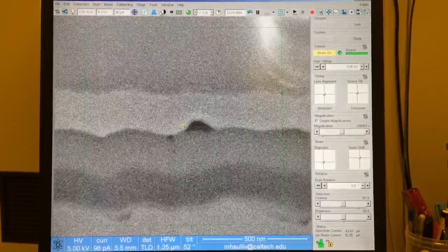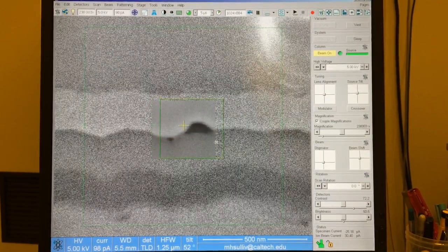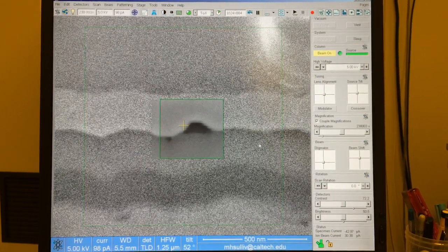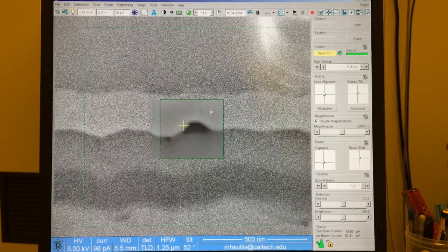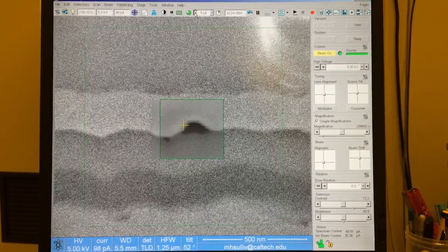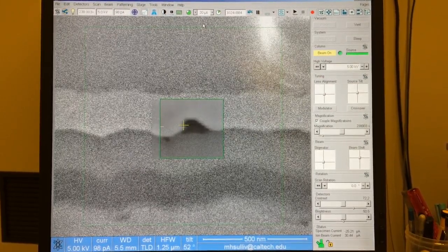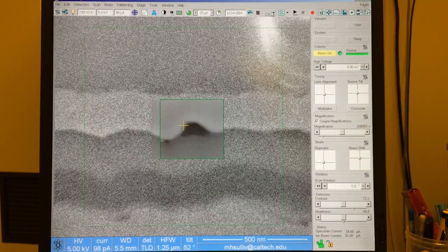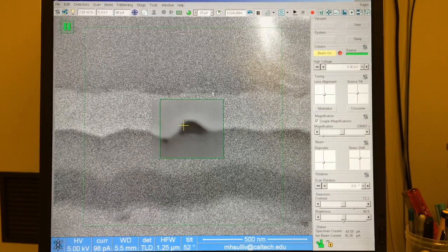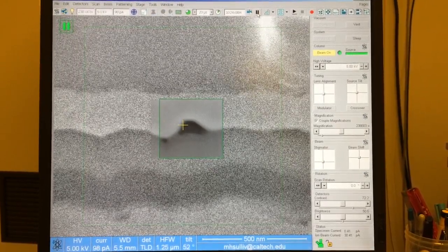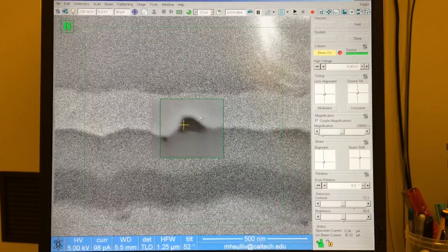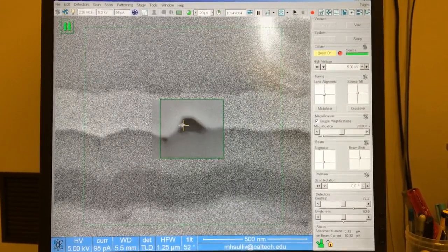Now I'm going to turn that reduced window back on. I can run through my first approximation again on this feature and try to get focus and astigmatism. It's really hard to know exactly if I've gotten it right or not. So what we'll do now is slow down the dwell time back to 20 microseconds, and rather than scanning live, we're going to integrate one frame at a time. Every time we grab an image using the pause button or the F6 key on the keyboard, we'll get a nice clear image, which will allow us to evaluate how we're doing with our alignment.